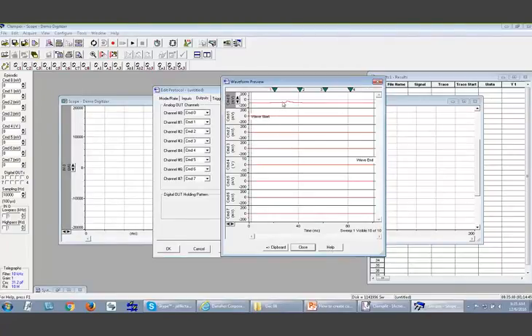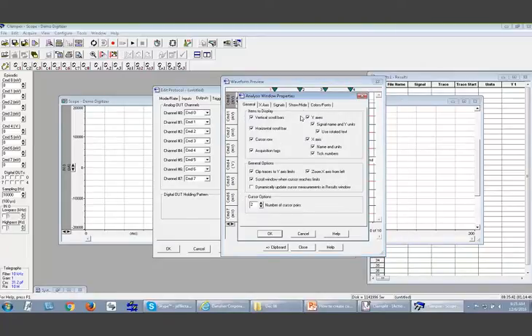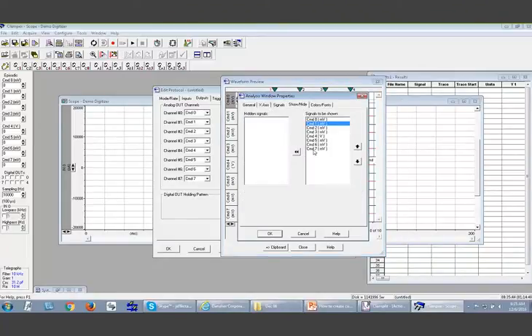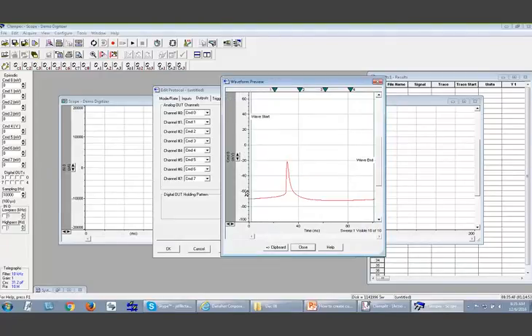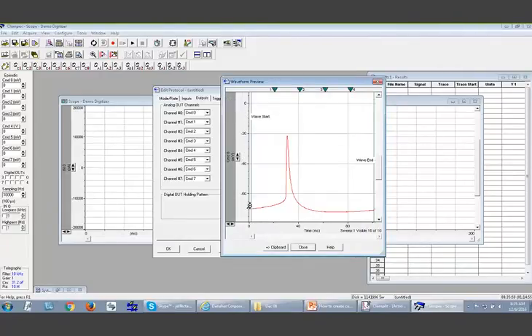You can see more clearly that this is very beautiful here. It is an action potential waveform that you can apply to the next cell or the current cell that you have. All right, so I showed you how to create your own waveform.